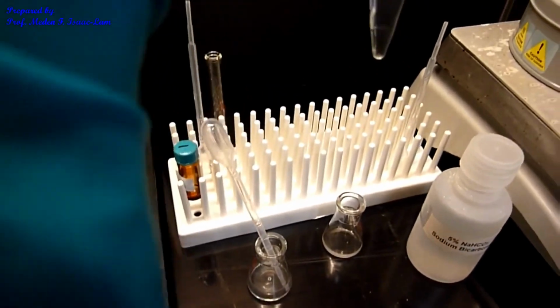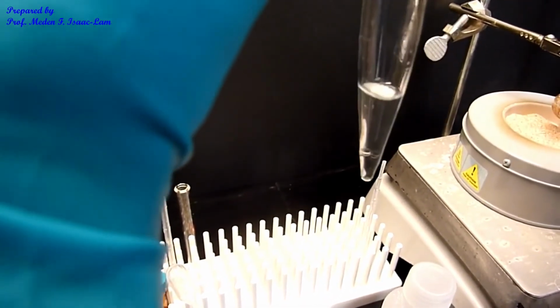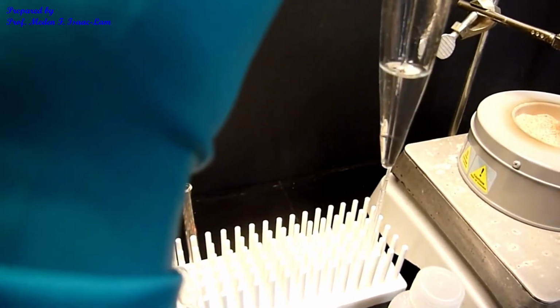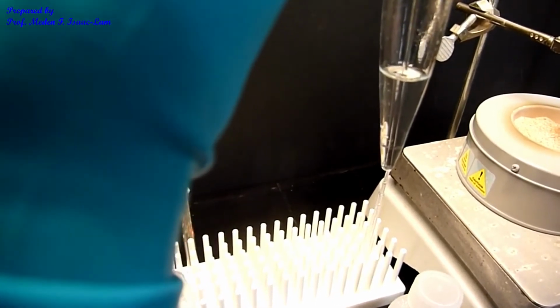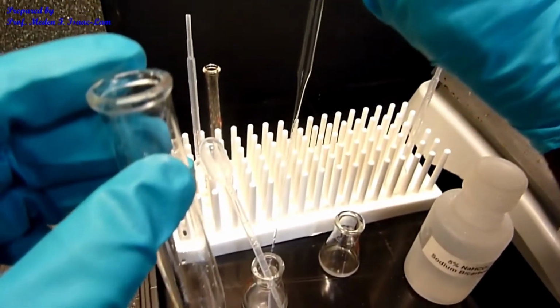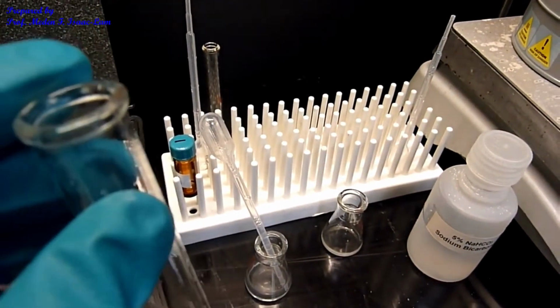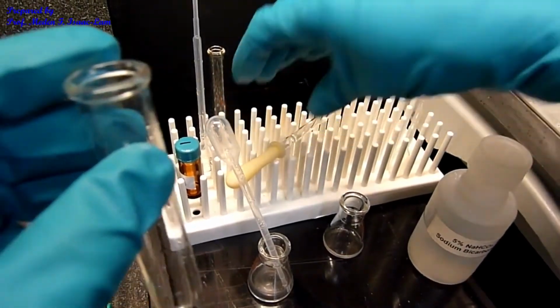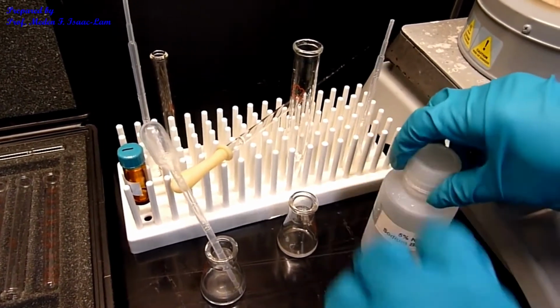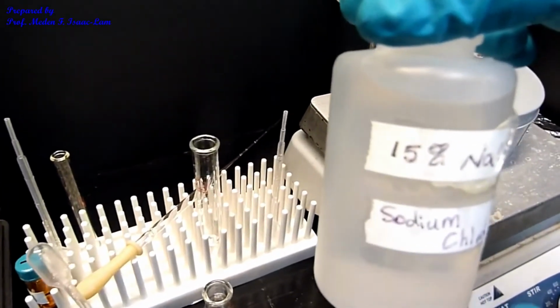So I still have a tiny bit. So I'm gonna... so out, and now I'm now going to do the next step. So I'm done with the base wash, which is the sodium bicarbonate, and I'm now going to use 15% NaCl.